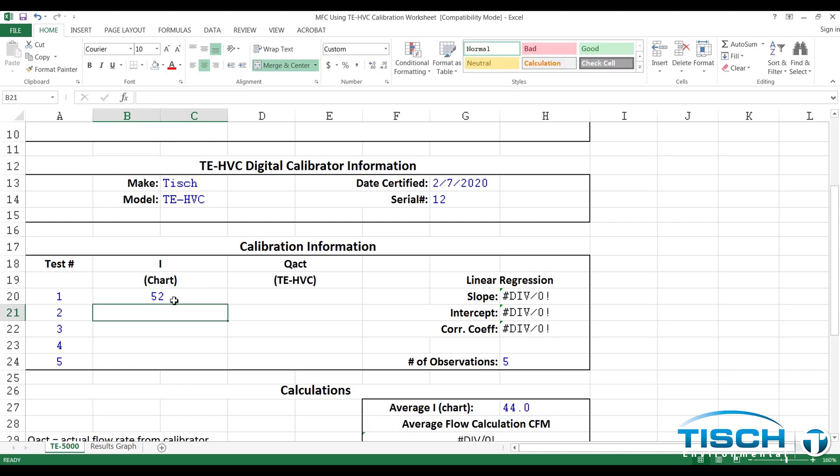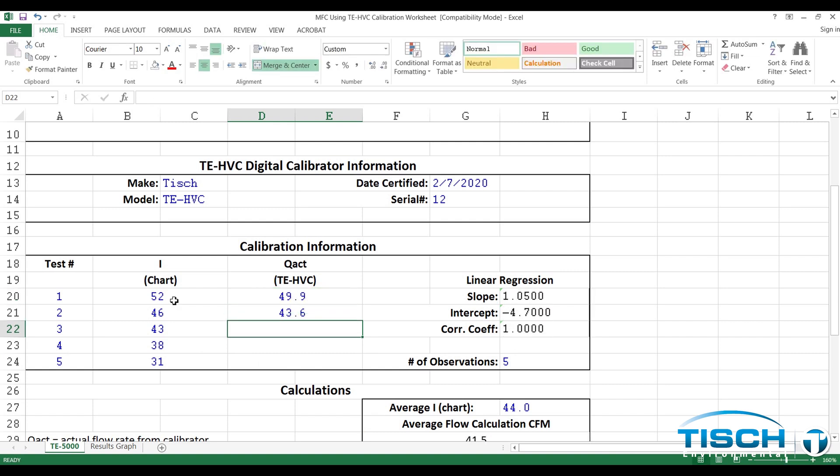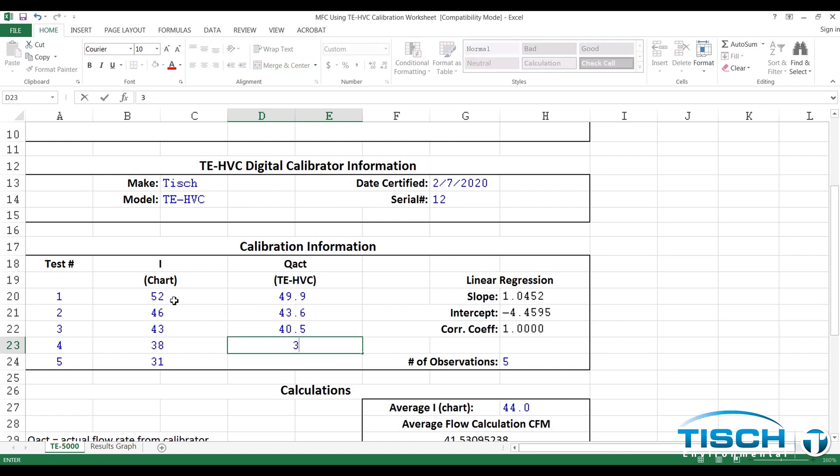In our example, the chart readings are 52, 46, 43, 38, and 31. Then you will need to enter the Q-Ambient readings from the calibrator. Ours were 49.9, 43.6, 40.5, 34.6, and 28.8.